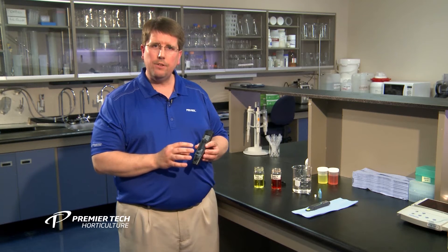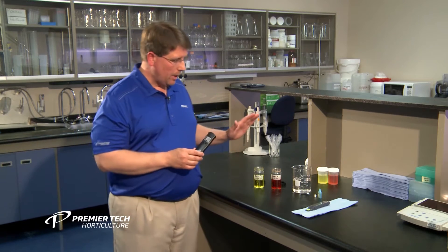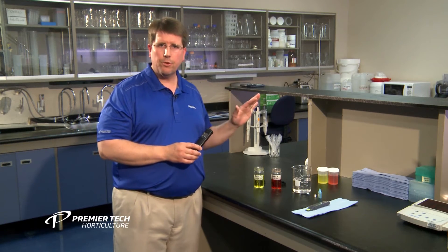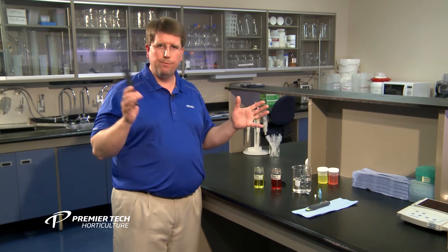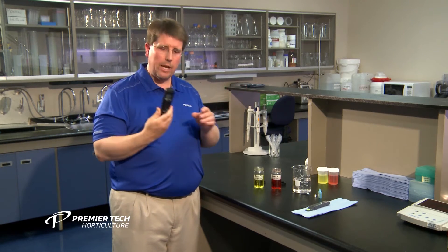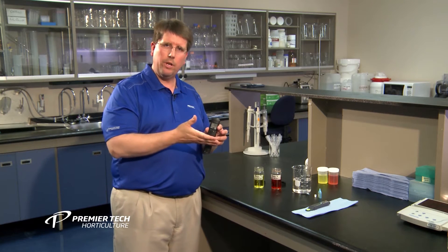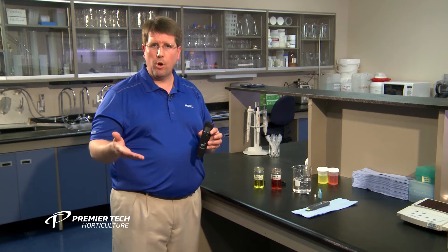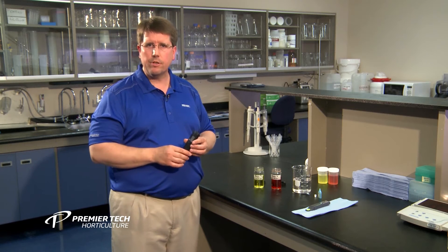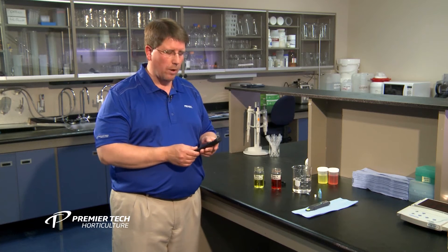With a pH meter, they're fairly easy to calibrate. Essentially, in most greenhouse or growing situations, you're growing somewhere between pH 4 and 8 — hopefully not at those extremes. So when you select a pH meter, you want to select something that will be calibrated at pH 4.01 and 7.01. These are very typical calibration solutions. In this particular case, we have a meter and we're going to go ahead and calibrate it.